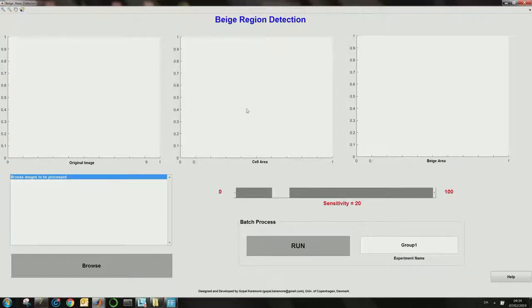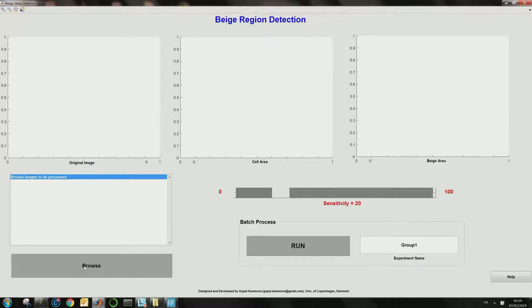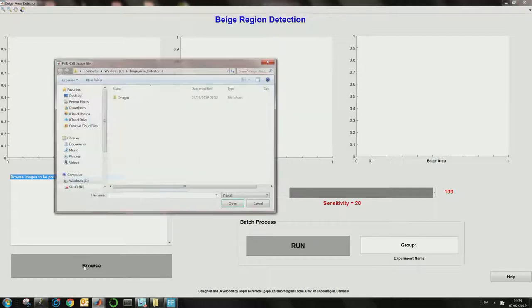Hi, this is Gopal. Welcome to the short webinar of beige region detection software. This software can be run in two modes: interactive mode and batch mode. In interactive mode, the user has to click the browse button and a small pop-up window will appear.